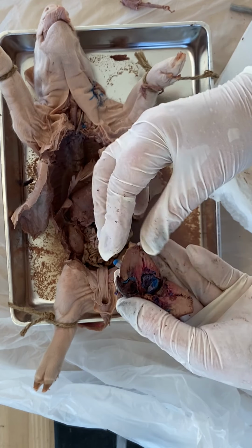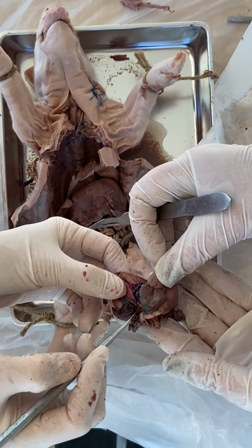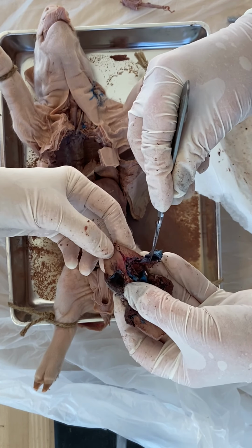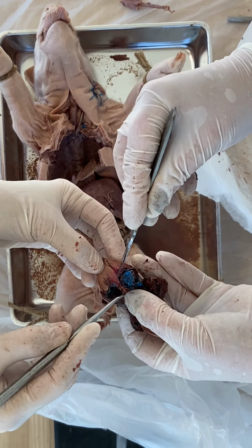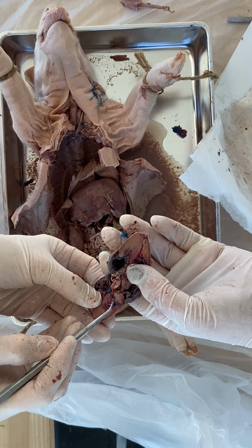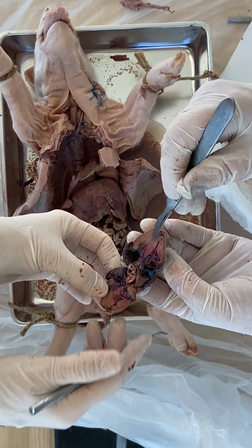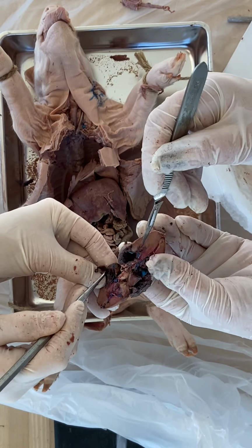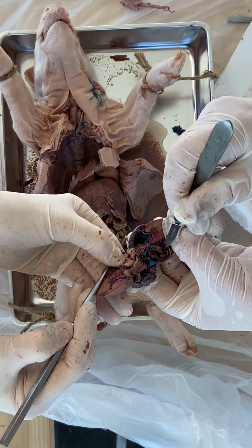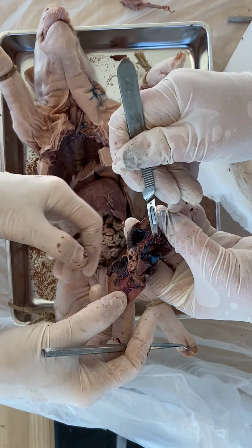Oh, I got a little bit too far one way. Okay. I think this is just dried blood. Yes, and that's some more. Now yesterday we could see heartstrings too, couldn't we? Oh, there's the valve right there. Okay, so we have ventricles at the bottom. I'm at a funny angle, I think, with the cut. Yeah, that is dry blood, isn't it? Yes, it is. Oh, a lot in this side.